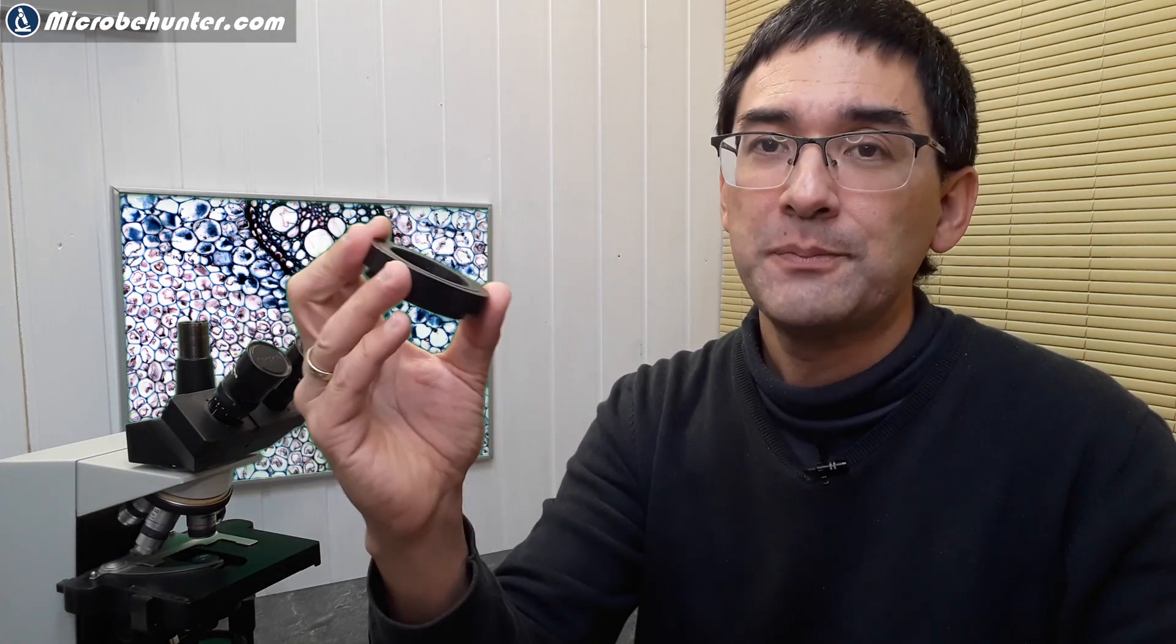Last, but not least, also important here, and this has to do again something with distance a little bit. This here is a so-called T2 adapter ring and this is camera specific. This one is general, and you have to get a T2 adapter ring for your camera. This one is for Canon EOS. Nikon is also very common.